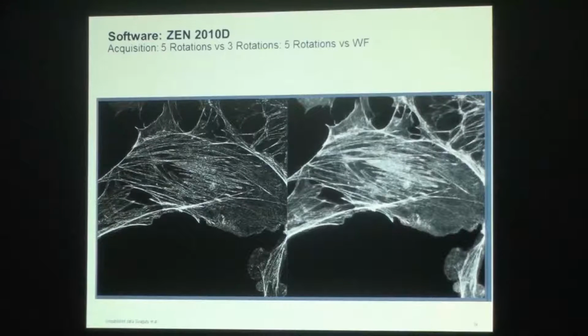But what you see here is the 3D projection of all the optical sections I have taken from these images. These cells are a projection of 12 to 15 slices in the Z. So this is a monocular image. It's a monocular image, though. Yes, it's the same field of view, but through the depth.